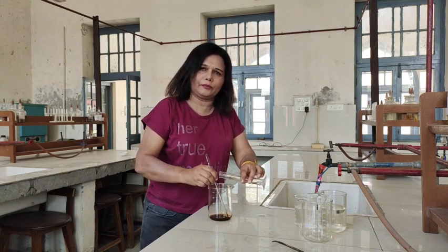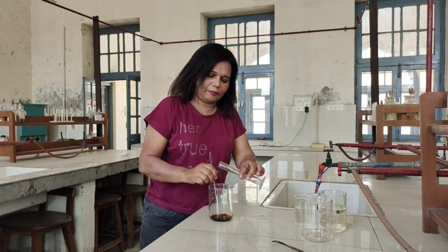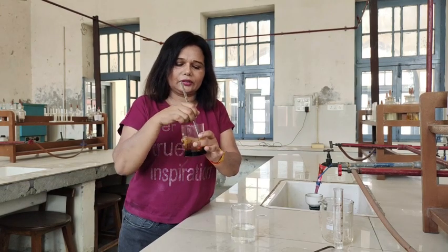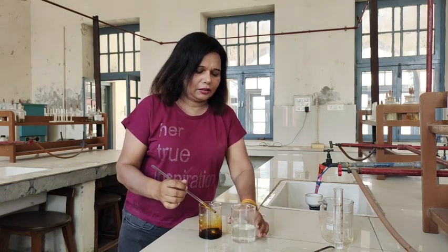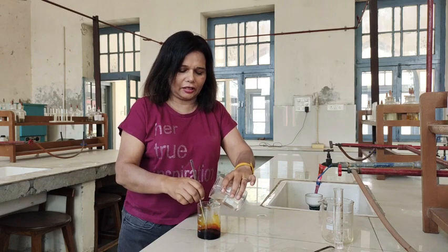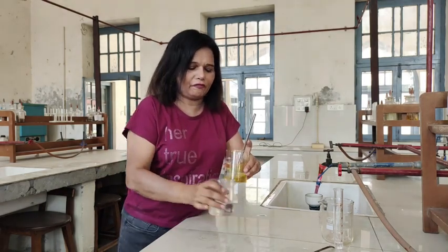As the reaction is exothermic, we'll have to cool it under water at time intervals. Here, students, you will observe that iodine completely gets dissolved in ethyl alcohol. Now we'll add 6% sodium hydroxide to it slowly along with shaking. And what you are observing, the brown color of iodine is disappearing and ultimately iodoform starts forming.